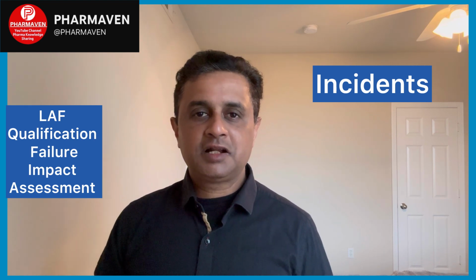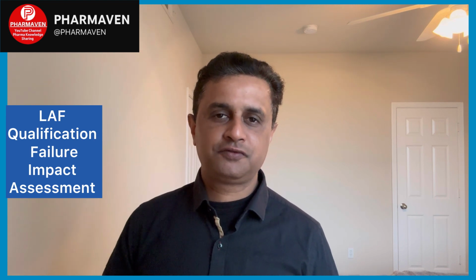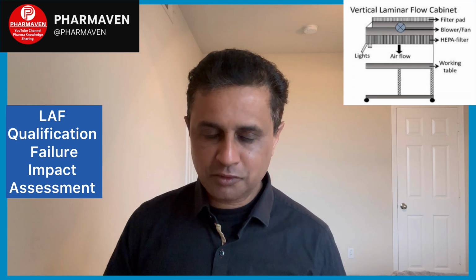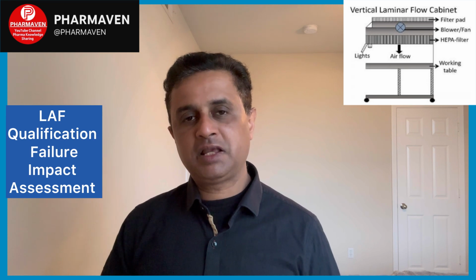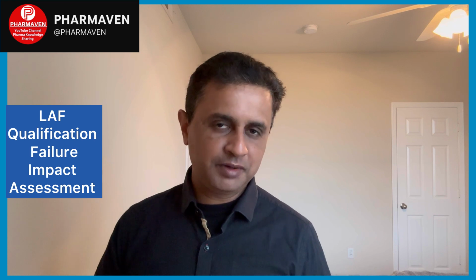Then determine at which specific location the HEPA filter integrity failed. Was there any damage at that location? Was there any spillage or chemical reaction, or was that part impacted during cleaning?